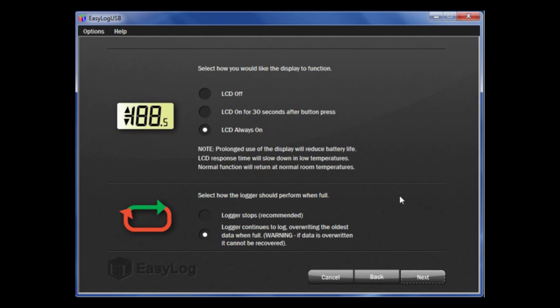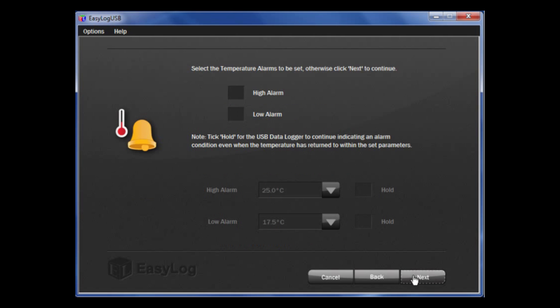Next, you can choose if you want the data logger to stop when it is full, or whether you want it to roll over and continue to take readings. If you are simply interested in alarms, then perhaps a rollover option is better fit for you. If you need to download and save all readings, then programming the logger to stop may be a better option. Once that is complete, click Next.